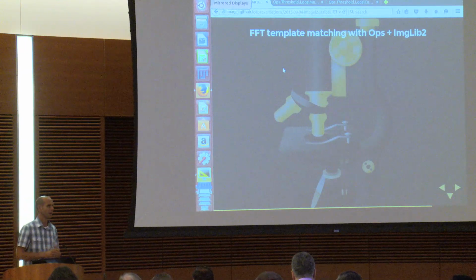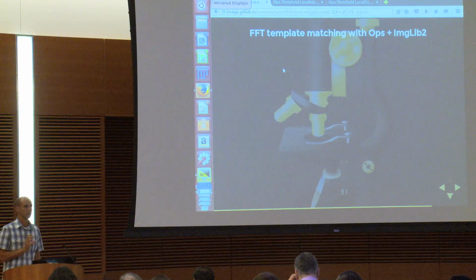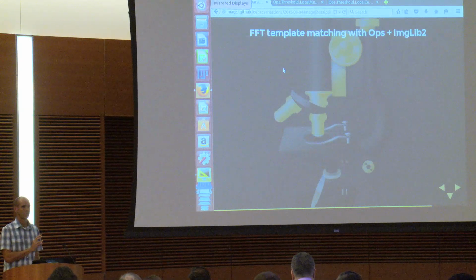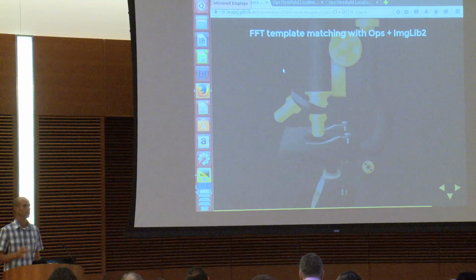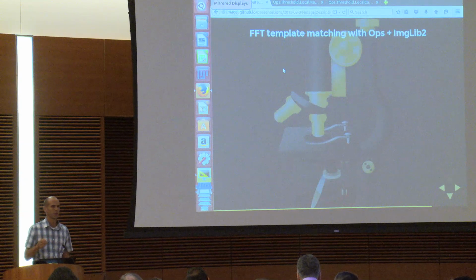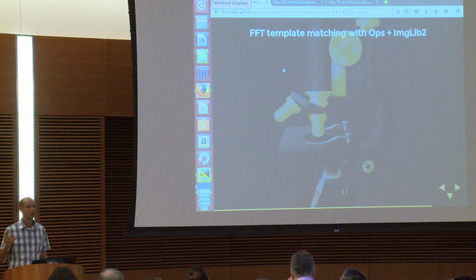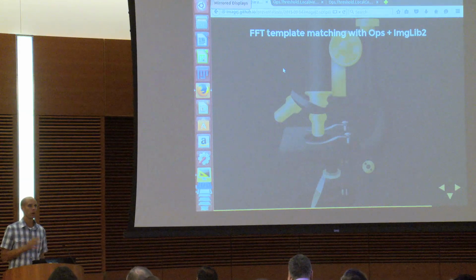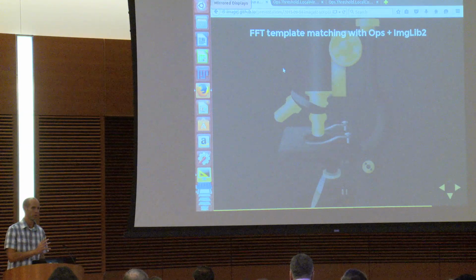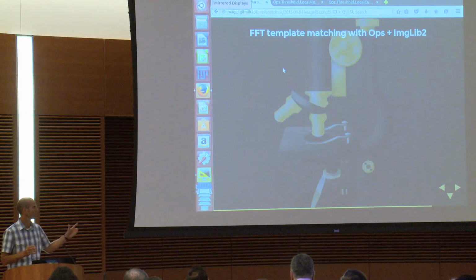ImageLib2 and some of the plugins that are written using it are really, really powerful. One of the purposes of ops is to access a lot of these little utilities. Like the TrackMate plugin had a lot of little cool utilities for reducing noise and pre-processing these noisy, spotty images, detecting spots before doing the tracking. But before ops, it was possible to use them in a script, but harder. So the purpose of ops is really to simplify.